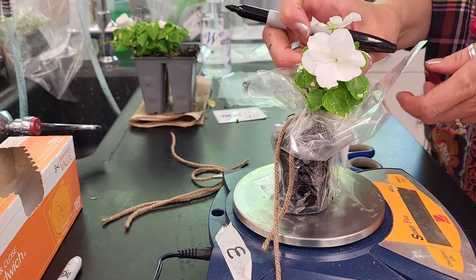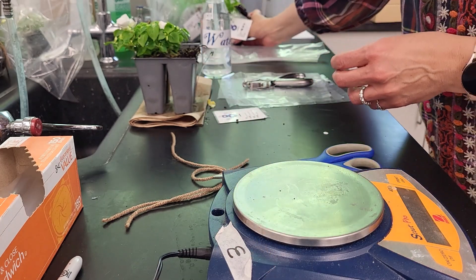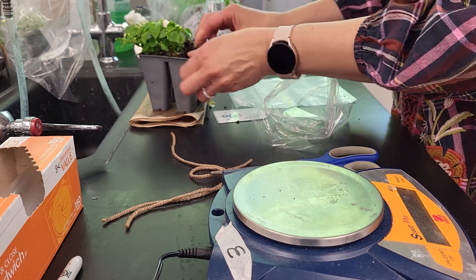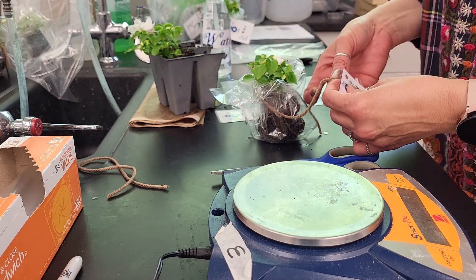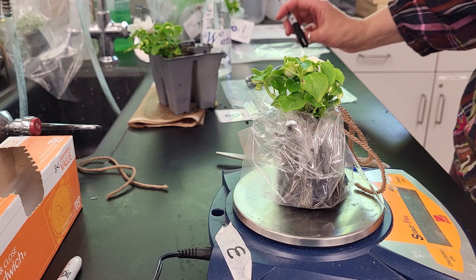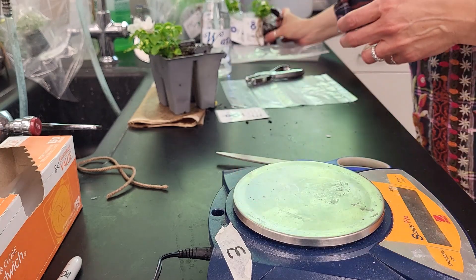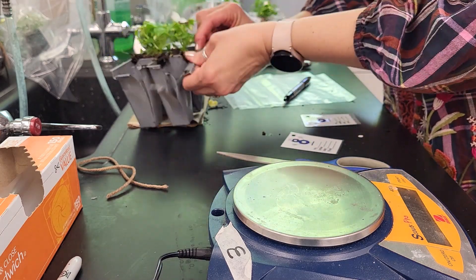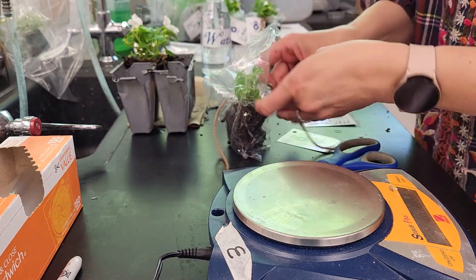This one looks like 96.61 grams — so 96.61 for our initial mass for that plant. We'll do the same with the other three plants. This one is 92.36 grams, and this one is 92.76 grams. We'll set those aside.